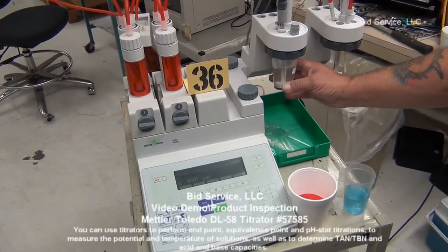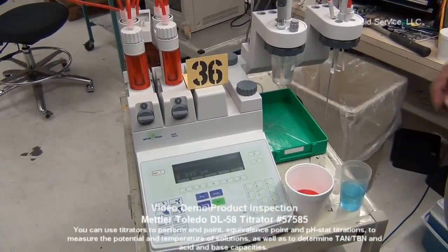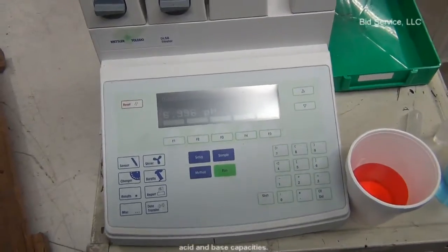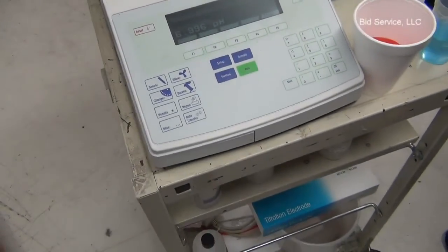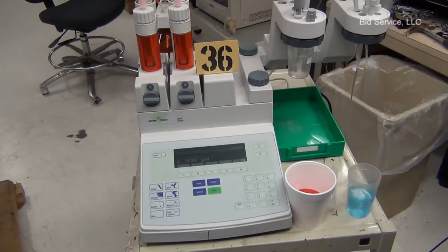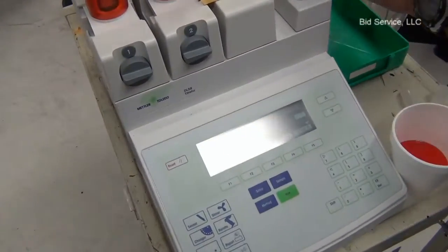As you can see, I've got pH 7 in this cup right now and if you look at the display it's showing pH 7. I did a two-point calibration yesterday. So I'm going to stop this and take this cup out.